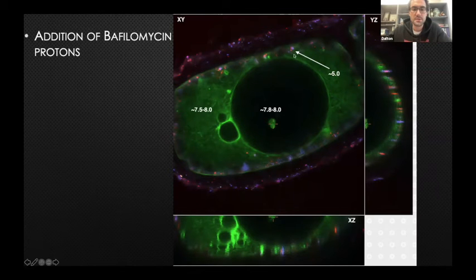What's interesting though, and Jake kind of touched on this with the TEM images, is that it looks like most of the endobionts are within vesicles. That's not always the case though. It does seem that there's some that are free floating, or they're not showing up with the Bodipy dye, and that they're not membrane bound.